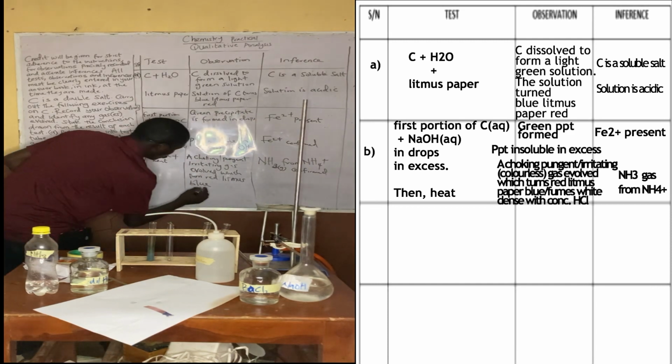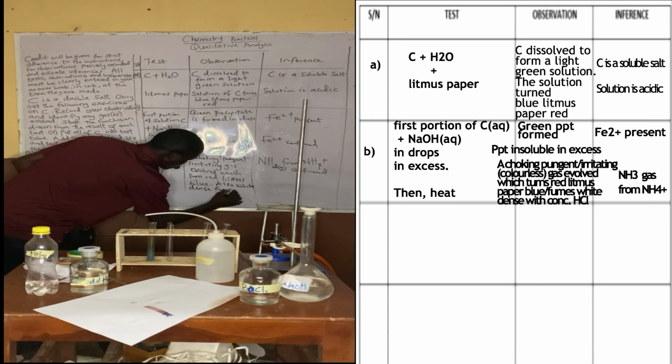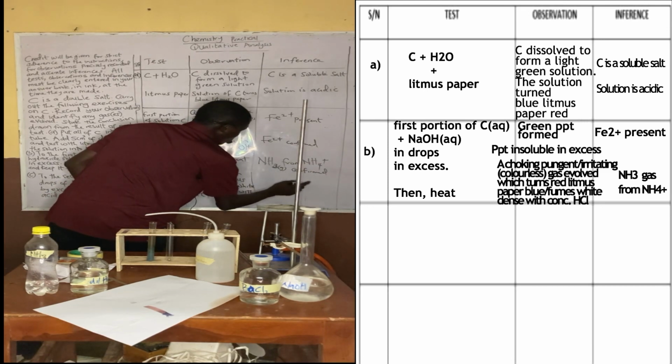So now you can also say that it also forms white dense fumes with HCl, concentrated HCl. Let me write, this one is conc, concentrated HCl. So now NH3 from NH4+ is confirmed.